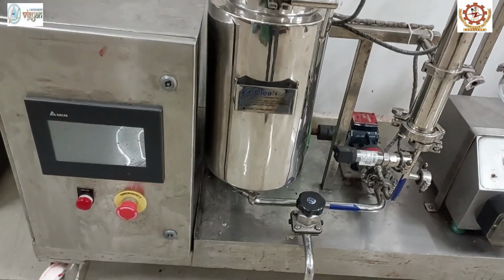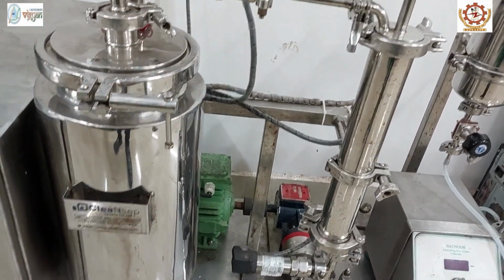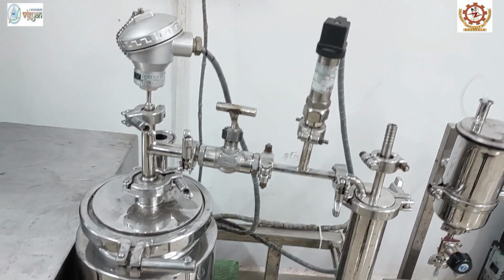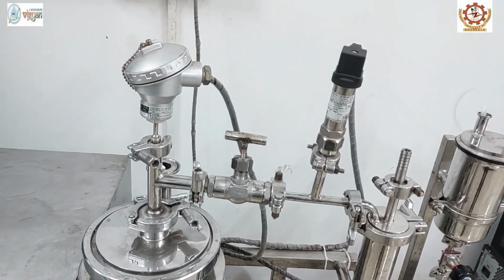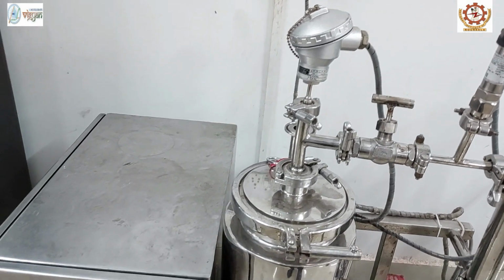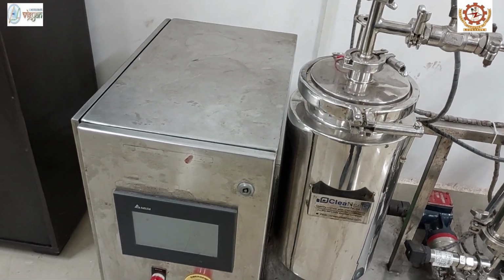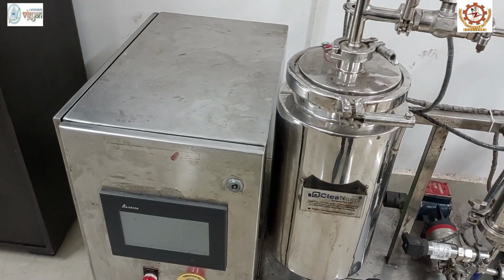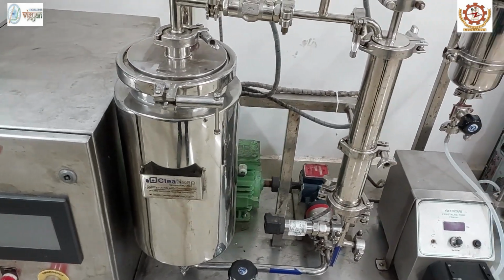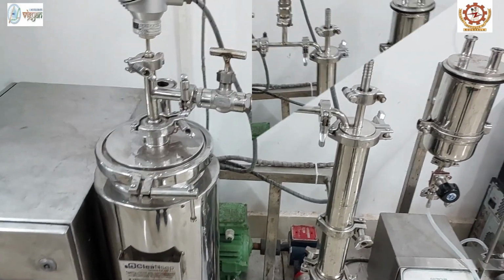Traditionally, juice concentration is carried out using evaporation techniques, which involve high energy consumption and high temperature, resulting in quality depletion due to the formation of off flavor, loss of volatile beneficial components, and degradation of color. However, concentration using membrane filtration is a non-thermal, low-cost technology which doesn't use any chemical agents or phase change.